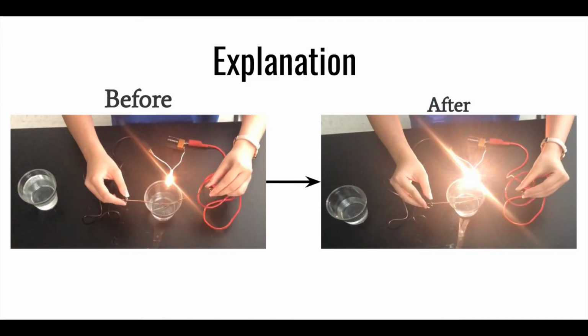As you dilute a solution, the molar concentration of the weak acid will lower as well. If the molar concentrations decrease, then Q will become less than K. Therefore, equilibrium will shift towards the products, which in return will increase percent ionization of the weak acid. If there is an increase in percent ionization, the acid will produce more ions. Pertaining to this lab, the more dilute the weak acid, the better it conducts, meaning the brighter the light bulb will glow. Essentially, the more ions released, the brighter the light bulb.